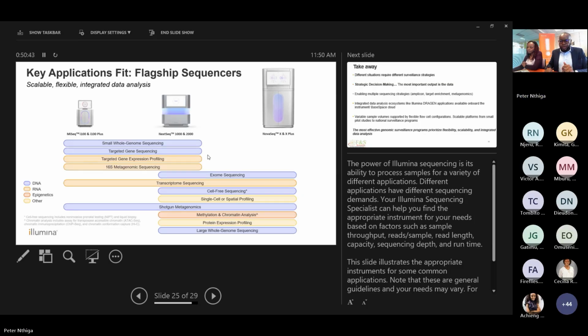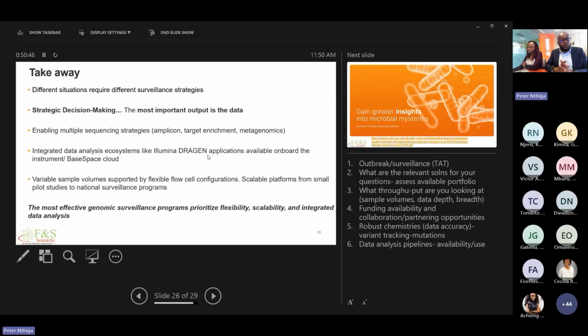So what are the quick takeaways from our webinar today? A quick recap: we've seen that for different situations, we require different surveillance strategies. And also we've seen that when we are performing a strategic decision-making process, the most important output that should be in the back of our mind is the data.